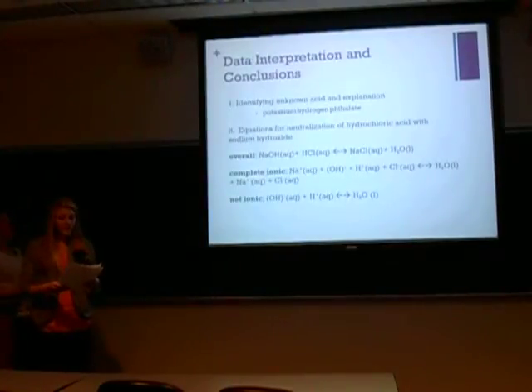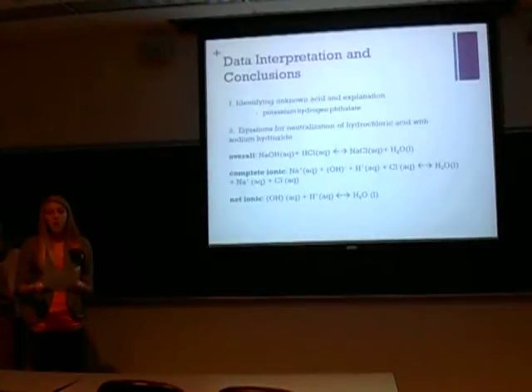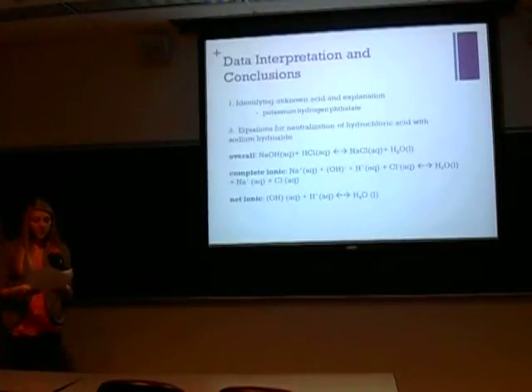The unknown acid is most likely potassium hydrogen phthalate. The pKa of potassium hydrogen phthalate is 5.51. The rough estimate of our pKa of the unknown in this lab was 5.00. The molar mass of potassium hydrogen phthalate is 204.2 grams per mole. This lab's unknown molar mass was 215.86 grams per mole. Although they aren't exactly the same, the values were the closest out of the possible options of our weak unknown acids.